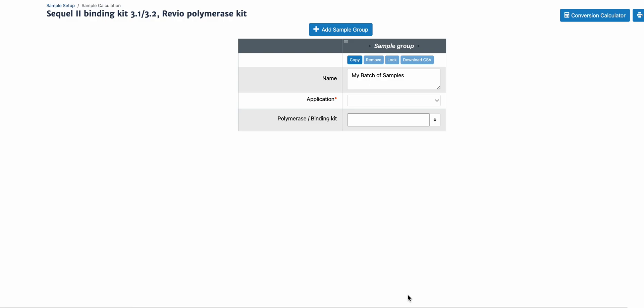This is the demo for sample setup and run design for the Kinex kits for SQL2, 2E, and Revio systems.